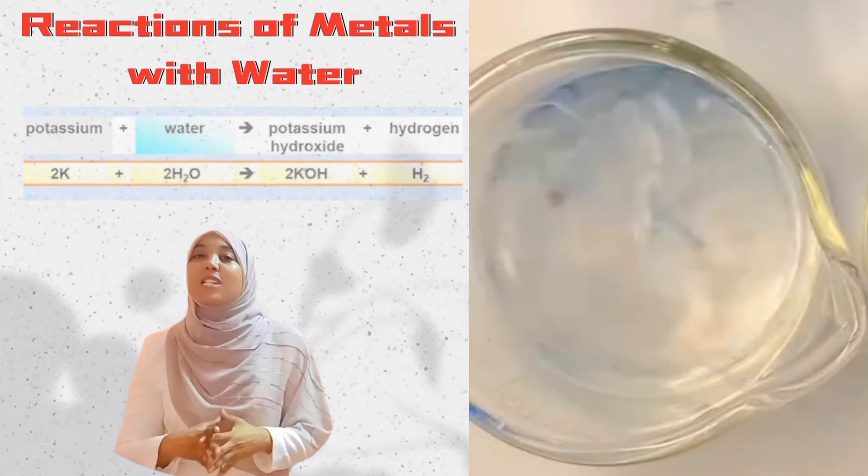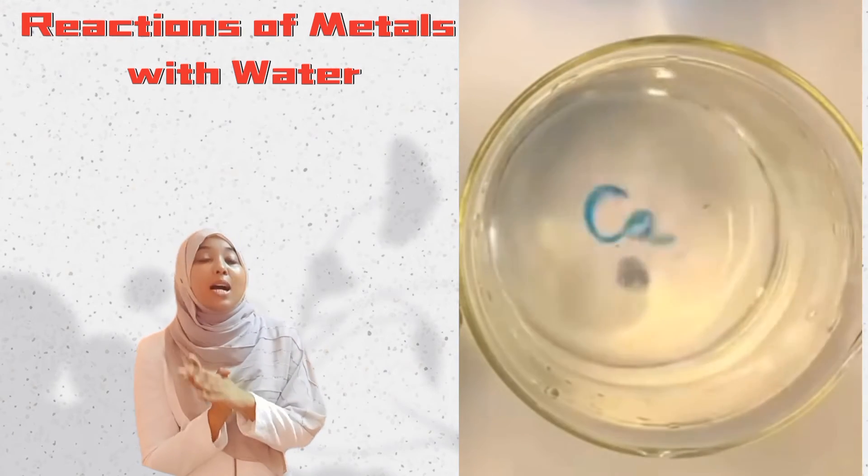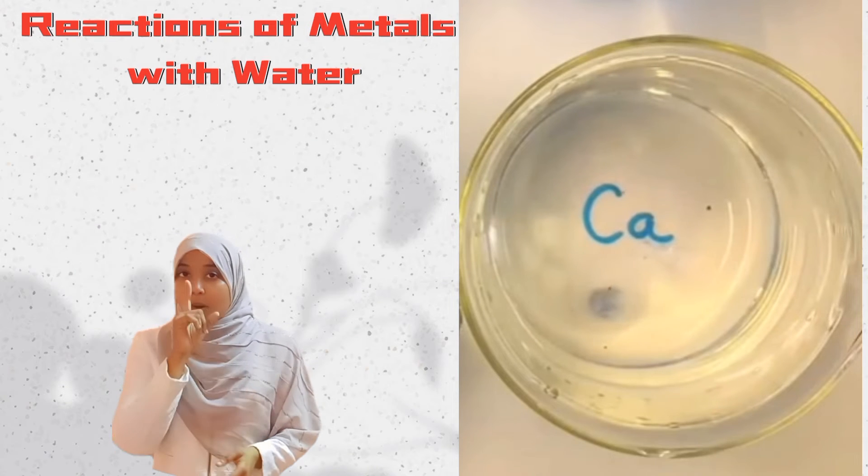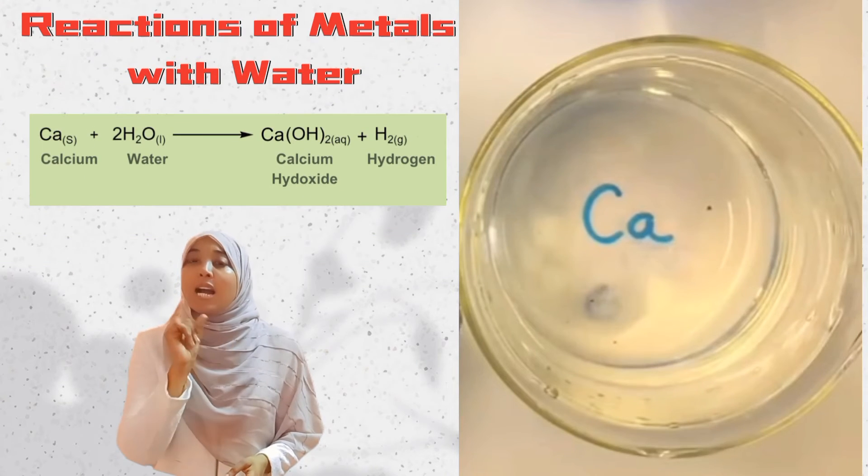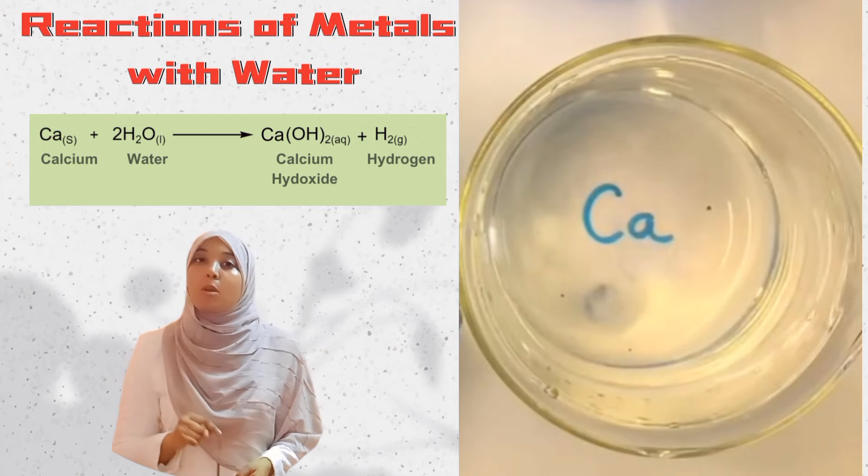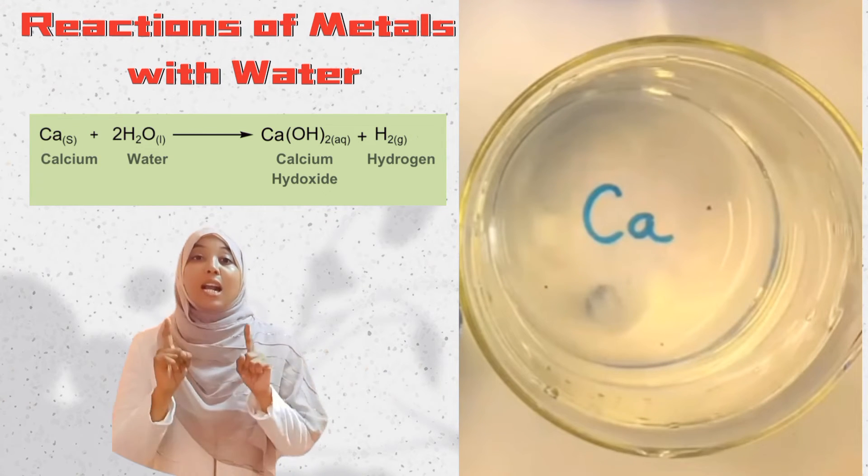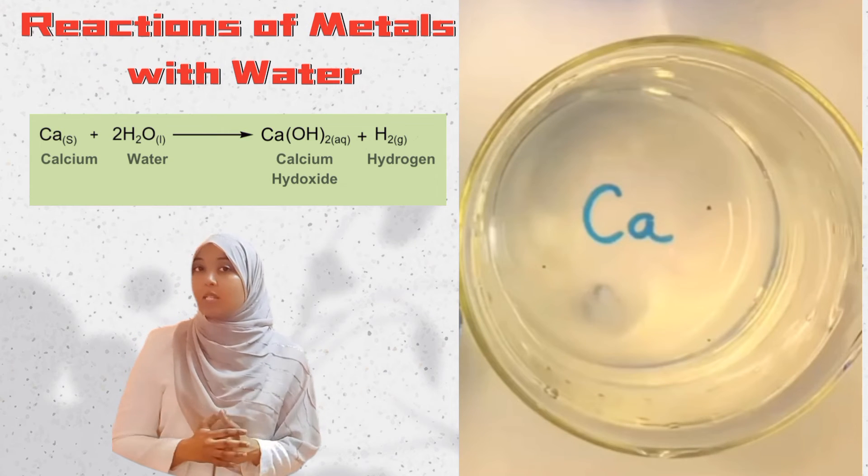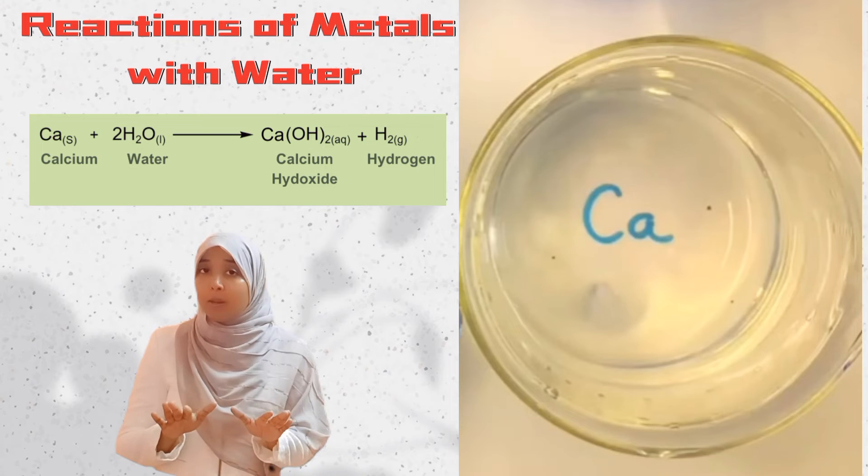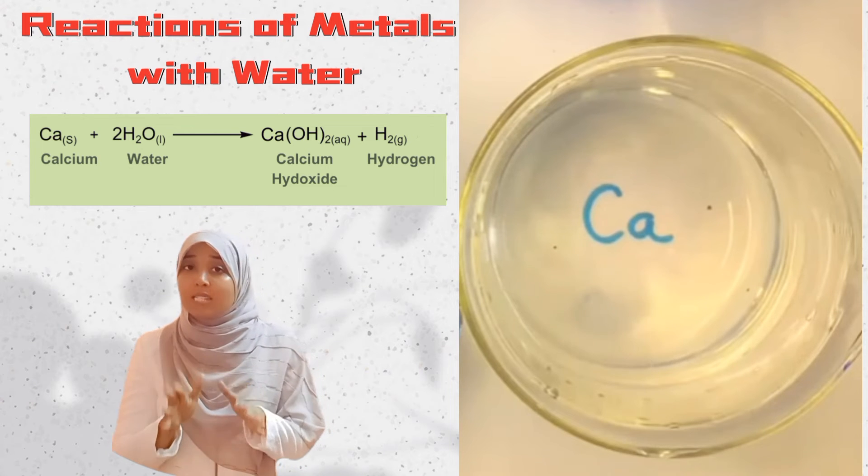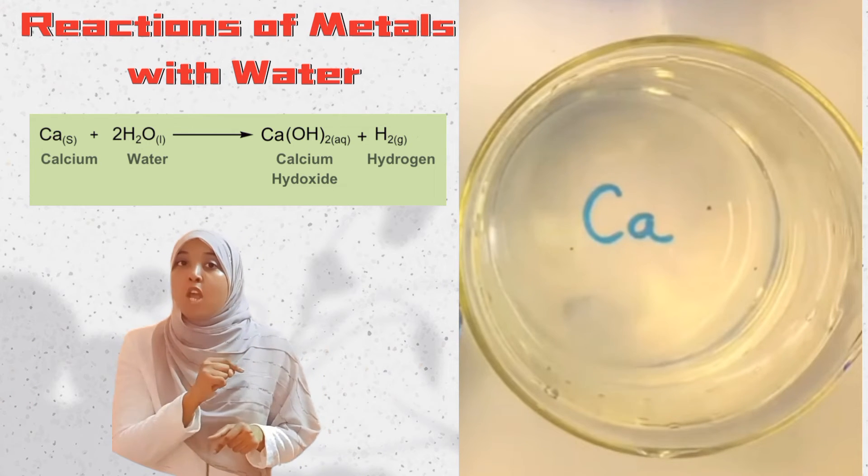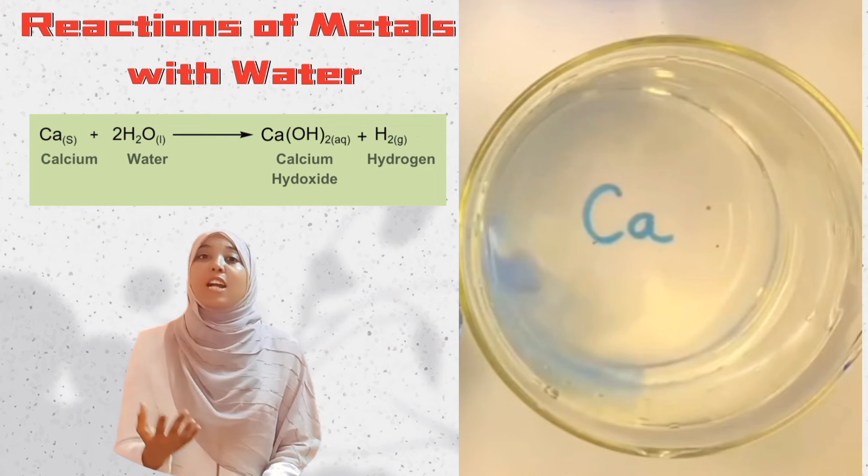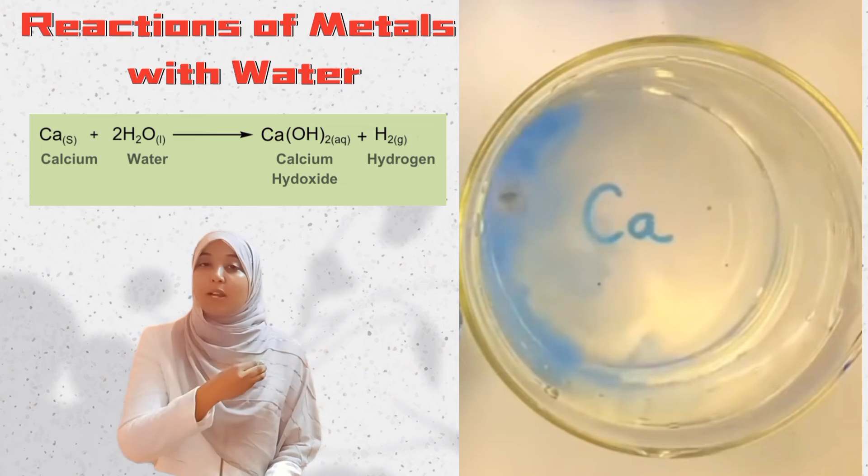Now our last one: calcium. Calcium is less reactive than all three metals. Observation number one: calcium metal sinks to the bottom of the beaker because calcium is denser than water. Then the reaction takes place. The reaction is slower than the other three, but it does happen. If you look closer, you can see fizzing—the production of a gas, which is hydrogen gas. The reaction leads to the formation of calcium hydroxide, which again is basic.